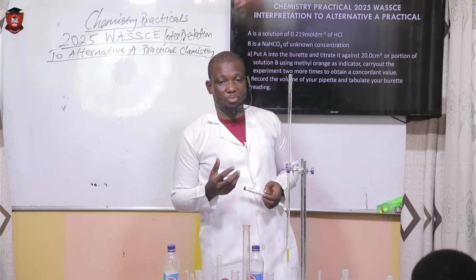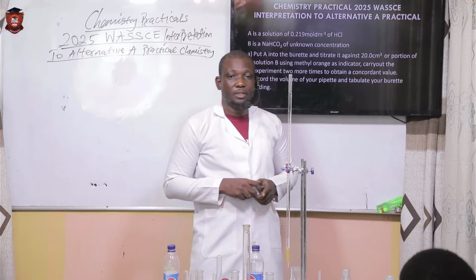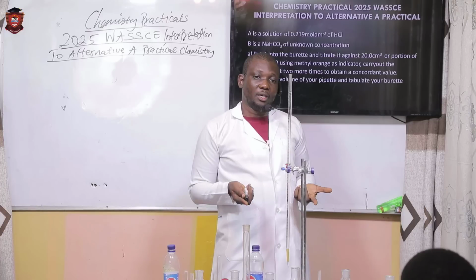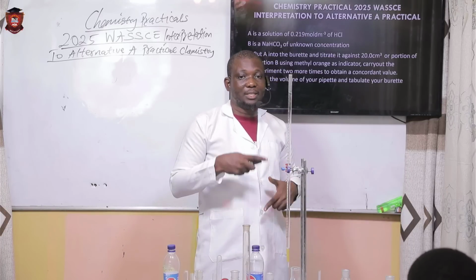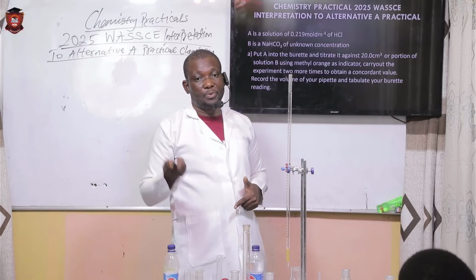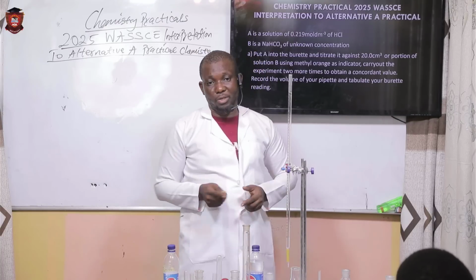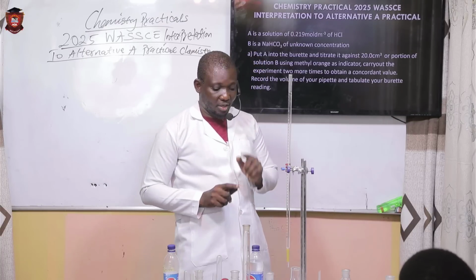Suppose you are asked to state two precautions used in the course of this experiment. One of them is that after putting A into the burette, I ensure that I remove the funnel, so that there is no additional volume after taking my initial reading. So that is very, very important.